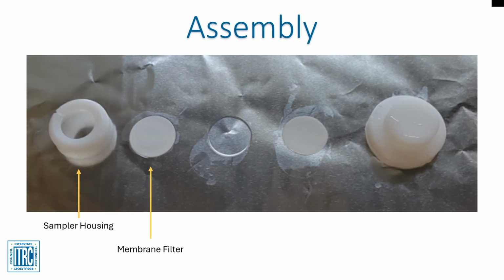Select the applicable gels and membrane filters, which are based on chemical and media targeted for sampling. Stack the resin and diffusive gels on top of each other between the membranes into the DGT housing or DGT base and cap assembly. Store the assembled devices hydrated with deionized water at room temperature or refrigerated in airtight bags containing applicable sampling preservative. The device requires deoxygenation prior to use because dissolved oxygen in the diffusion hydrogel and binding gel can influence the speciation of redox-sensitive chemicals.